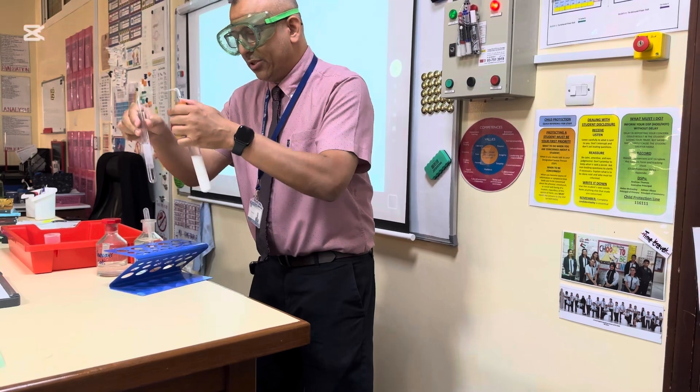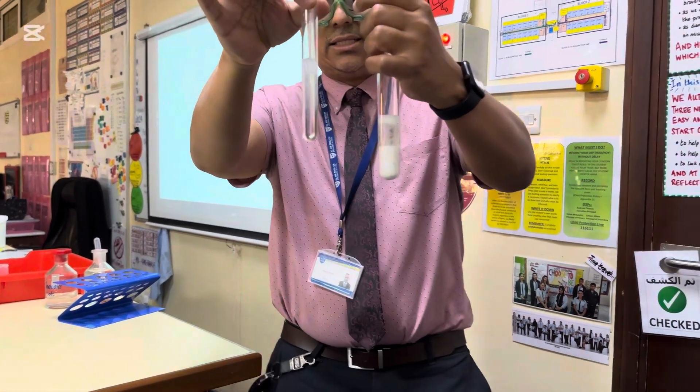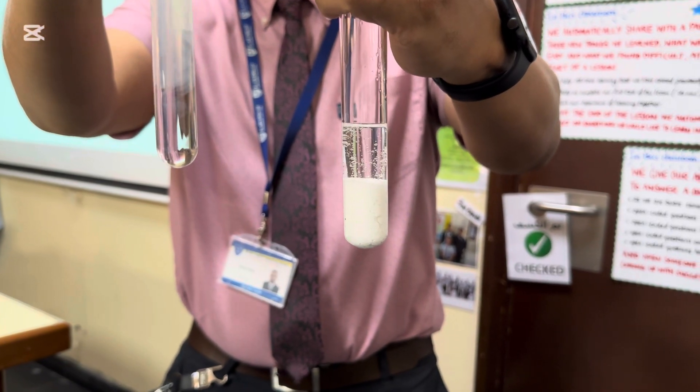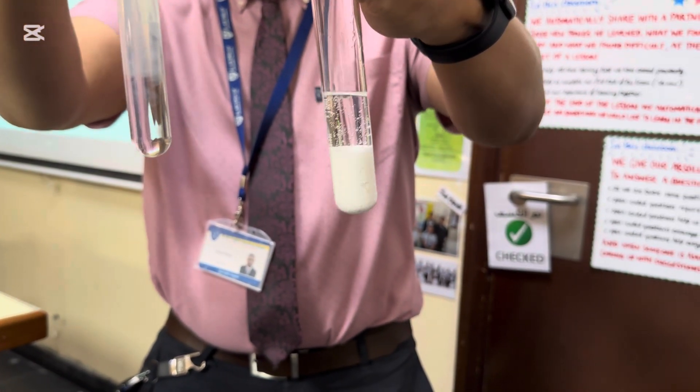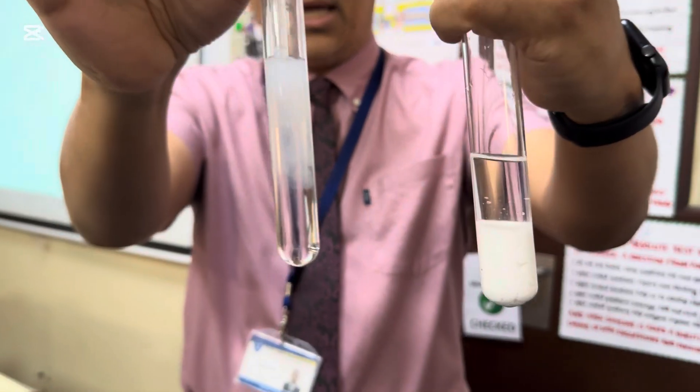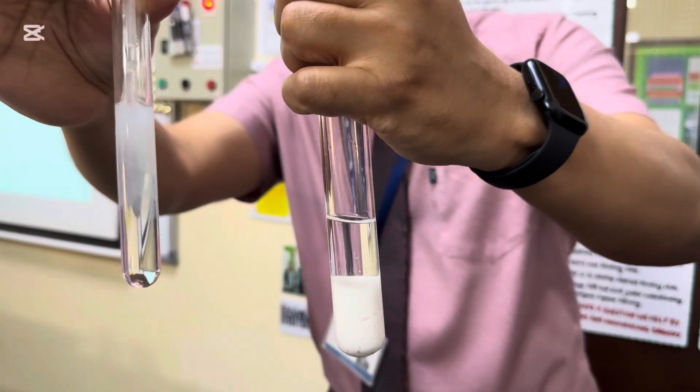And now I have the bubbles going through and you can immediately see the cloudiness. There's the cloudiness. I just about managed to get it before the reaction ended. But here we have that cloudiness. I'll just move to the side so you can see it.